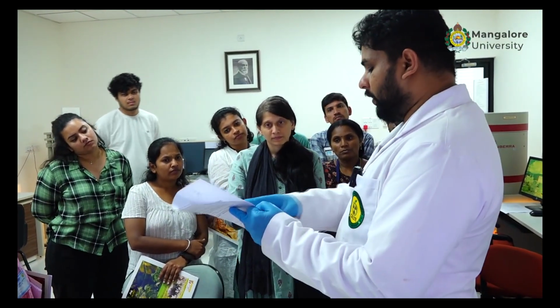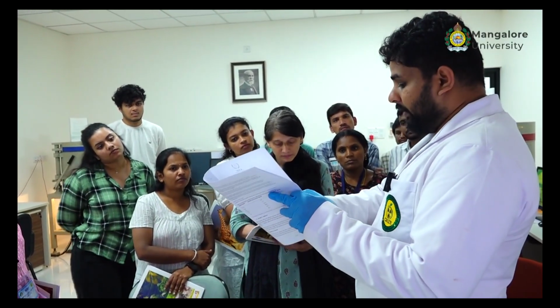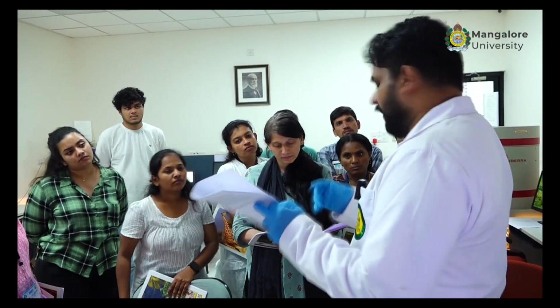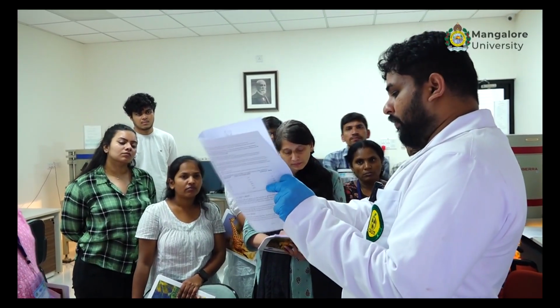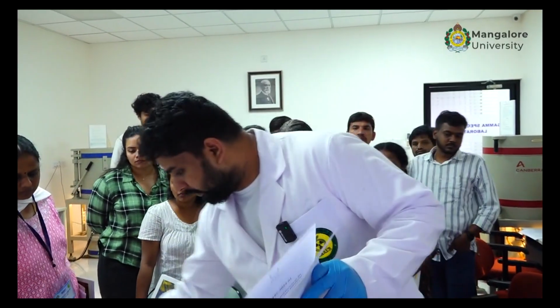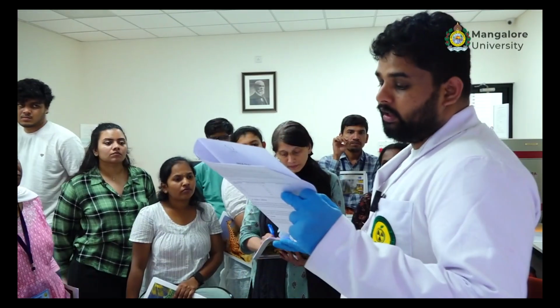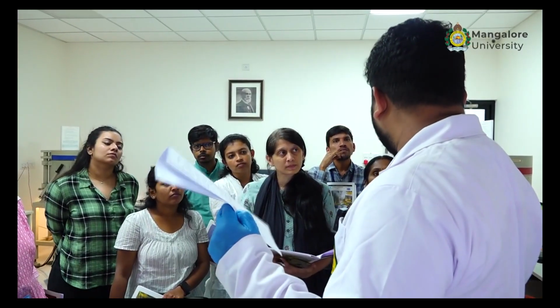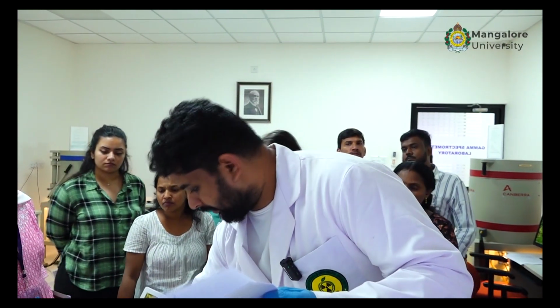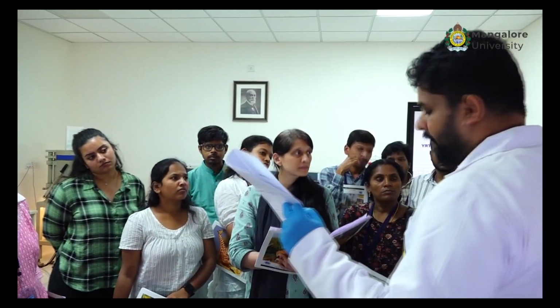So you have spiked water, this is QC, meaning quality control. Then you have sediment bauxite that I am not giving you right now. Then you can see 4 spike samples, in which sample number 5 over here is our sample that we have to analyze. Sample 6 is QC, quality control sample for cesium-137.